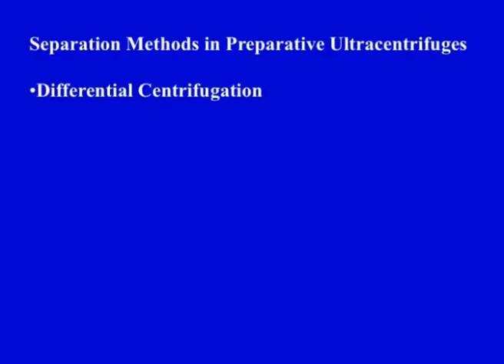Now, in this lecture, we are going to discuss the separation methods based on preparative ultracentrifuges. These are preparative methods where you are aiming to get the material for further biochemical investigation.